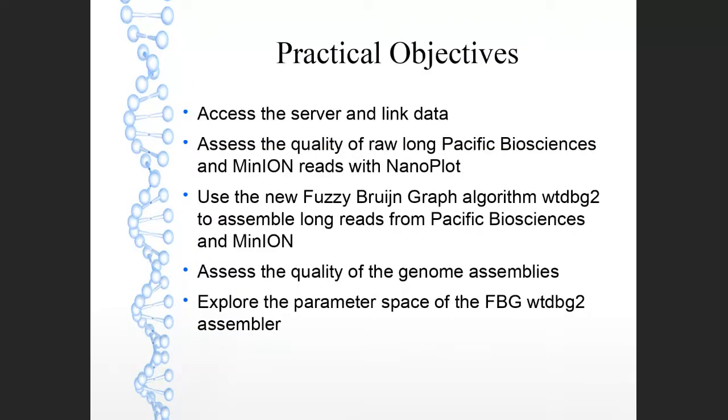So, what are the objectives for this week? First off, we'll be accessing our server as per usual, and then again, as per usual, we'll be finding the data on our system and making a soft link to it. Our data this week is rather large, so it's especially useful to link the data rather than copying it around the server.